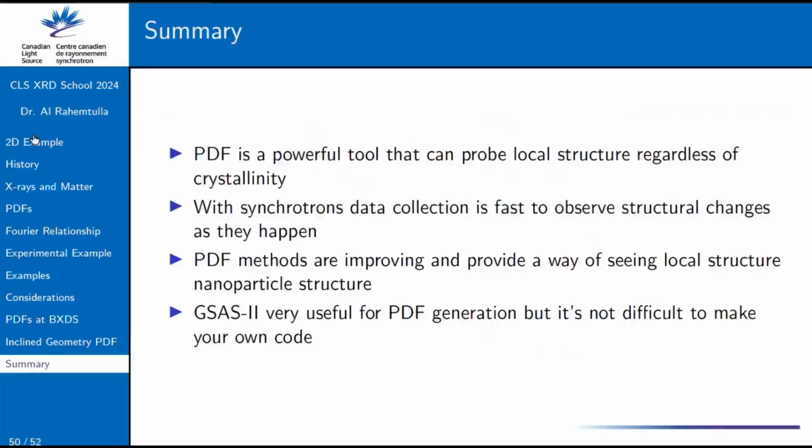In terms of software, working with GSAS is probably your best de facto tool to use. It's very simple to do in GSAS. It's in some ways almost too easy. It's pretty much a few button clicks to get yourself to a PDF.